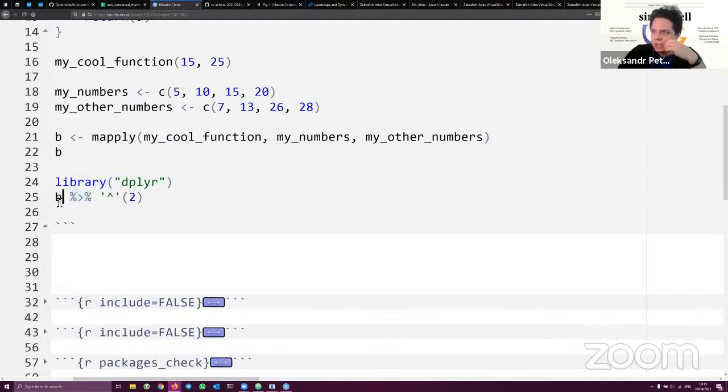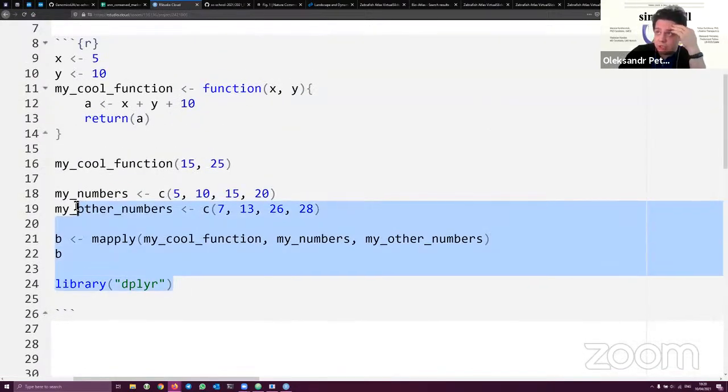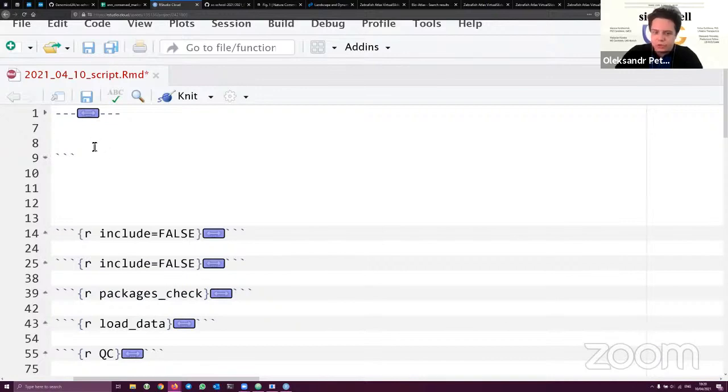So if you have something as an input, you can create as long a pipe chain as you like, and as an output, you will receive the result which passed through all the functions you have used. For example, we can also multiply with something, we can add something, etc. So it's just your imagination. This very basic example is very important because we will use these pipes and functions quite a lot in the code below.